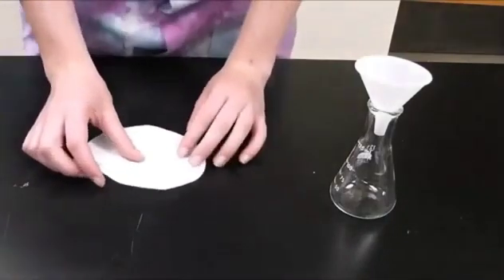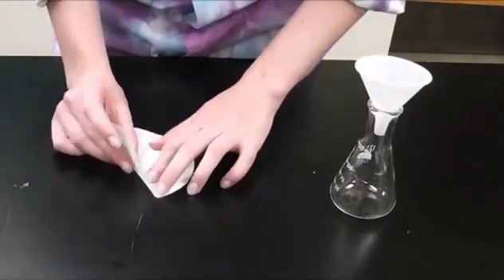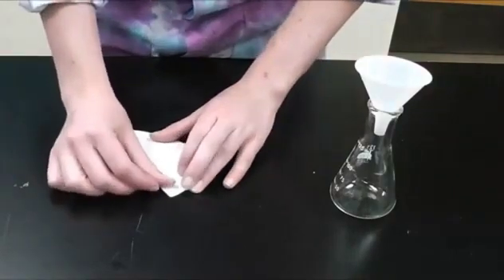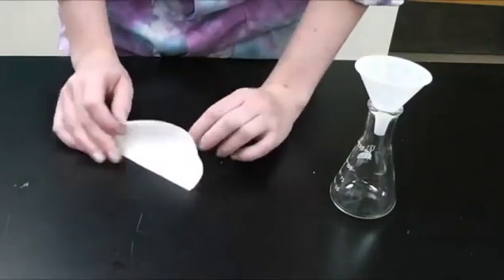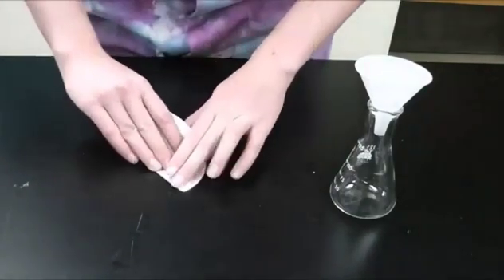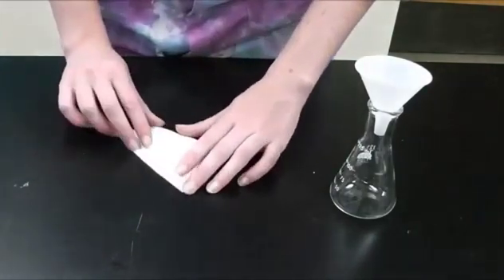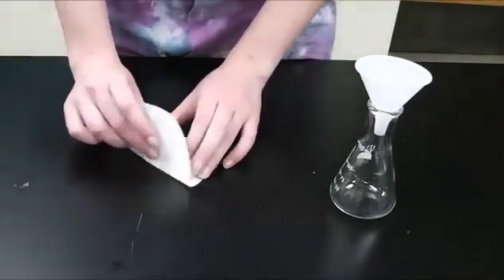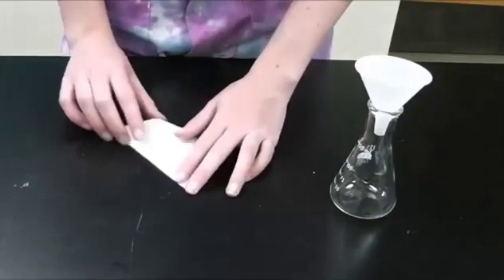Then flip it over on the bench and repeat what you just did, placing the folds midway between the folds made on the other side. When you are folding your filter paper, do not use a ruler or press too hard with your fingernail when folding, otherwise you might cause small rips in your filter paper.